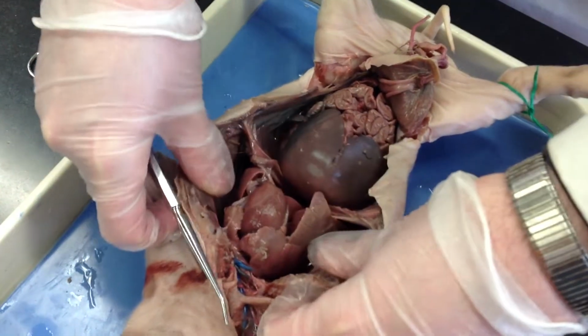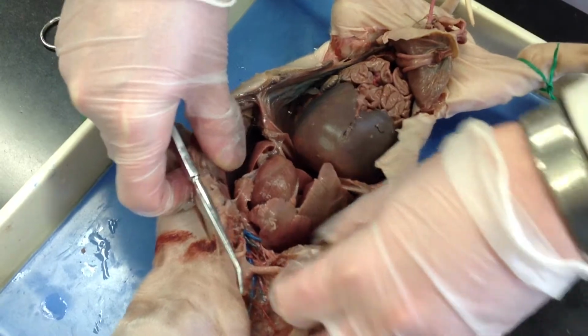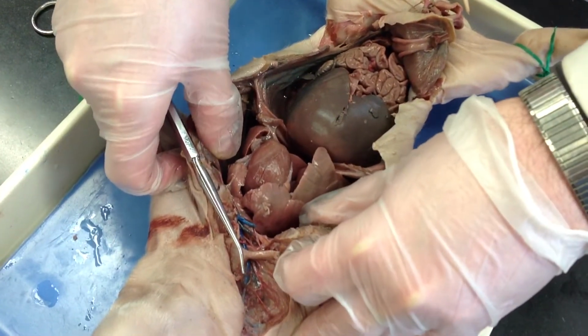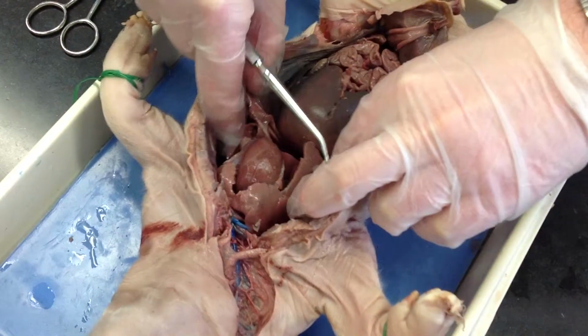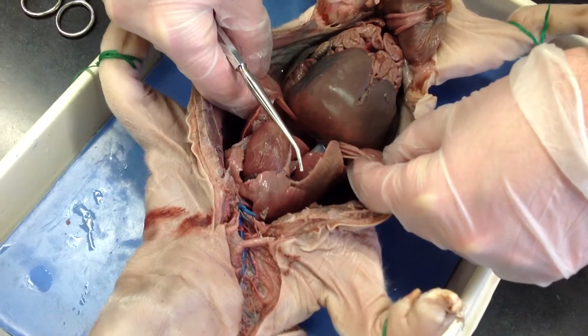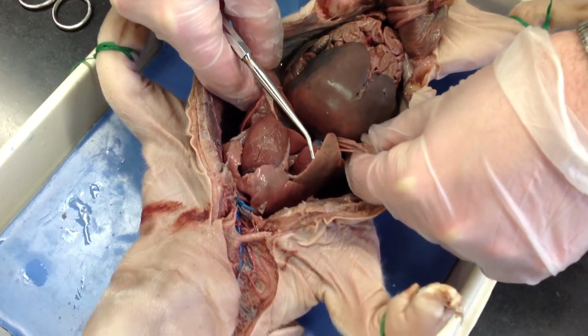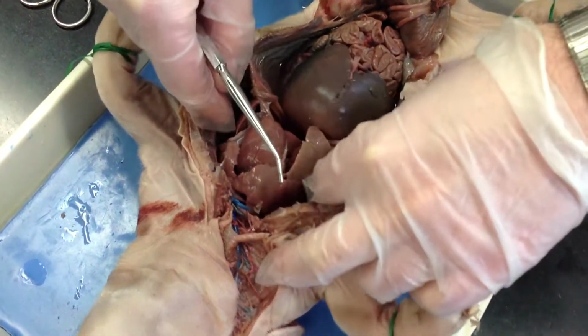Okay, so here we see the internal anatomy of the fetal pig. Like all higher animals, it has a true coelom, a true body cavity, which is divided into thoracic and abdominal cavities. The two are separated by the muscular wall called the diaphragm, and it's the contractions of the diaphragm that are involved in the breathing cycle.